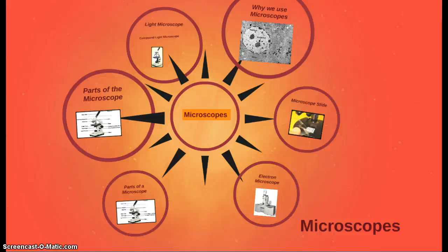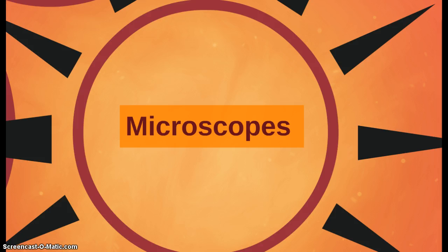Throughout our laboratory assignments this year, we will be using a microscope. This video was created to help prepare you to use a microscope. Microscopes are used to magnify an object. Magnification makes an object appear larger than it really is. A characteristic of a microscope is the resolution, and how clearly the magnified object can be seen.